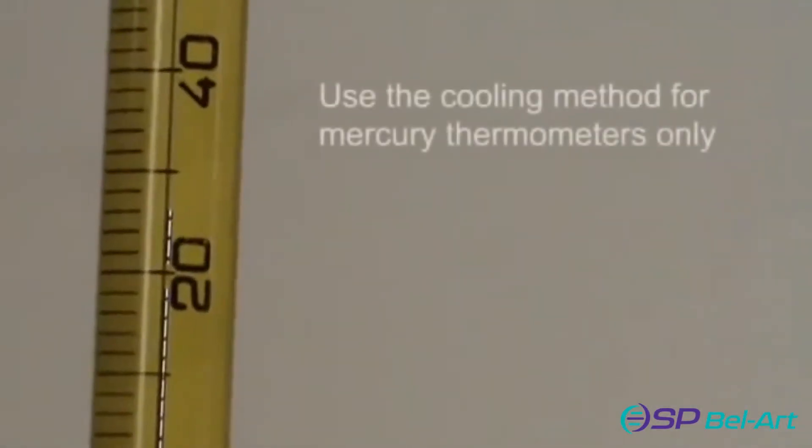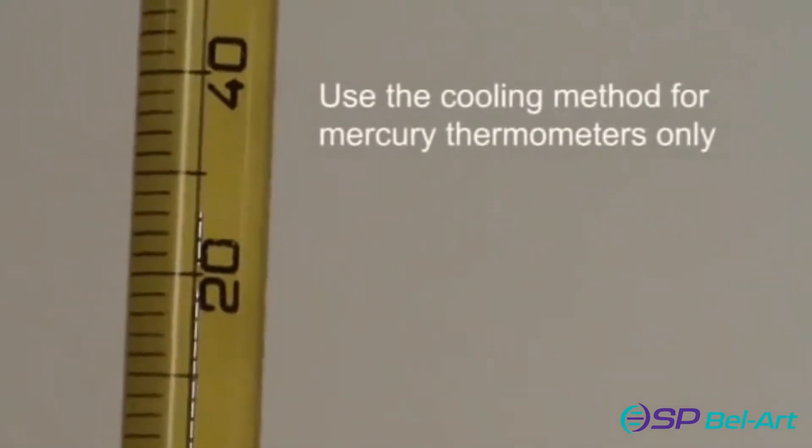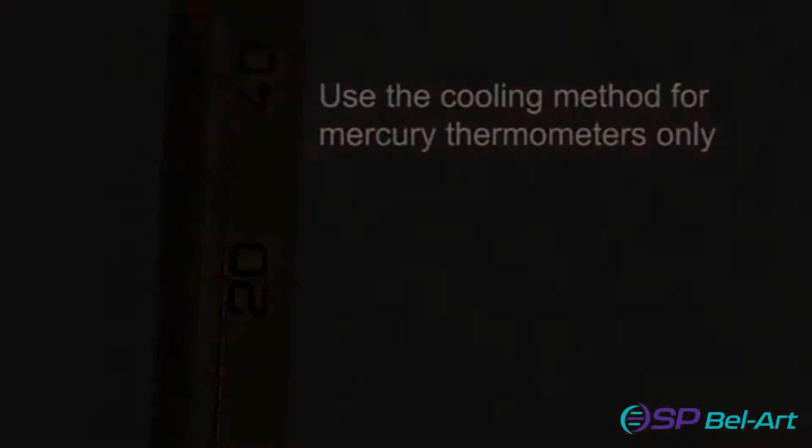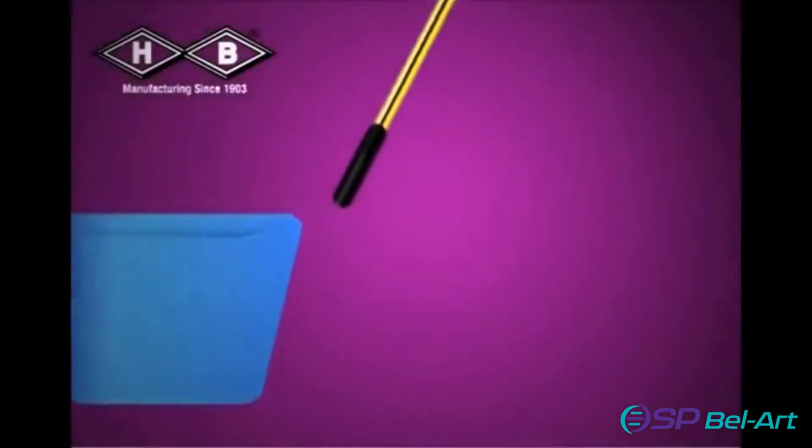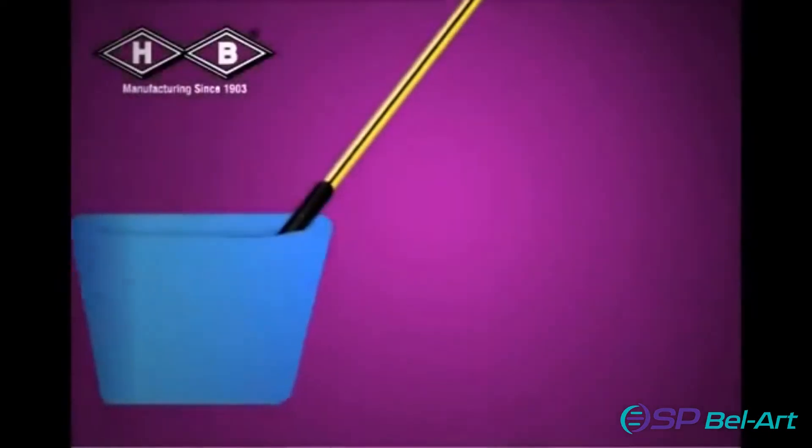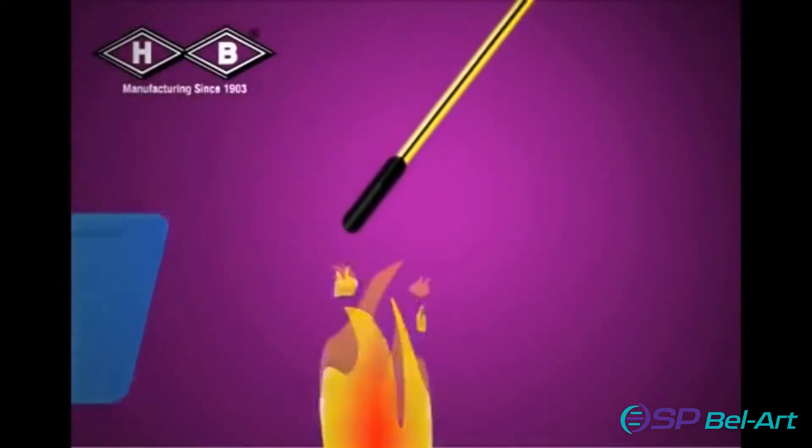The cooling method should only be used with mercury thermometers unless they have a contraction chamber, because this method may cause other liquids to freeze and the bulb to break. Depending on the separation, it may be necessary to apply both methods.